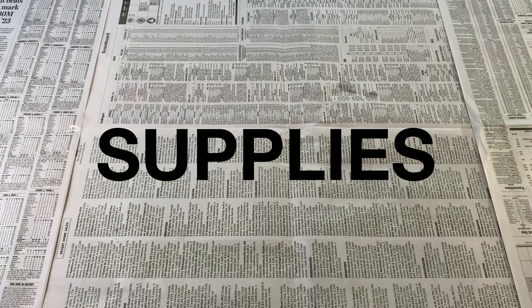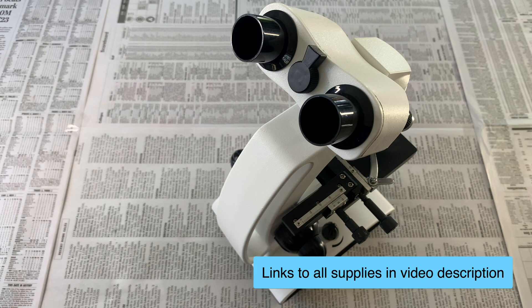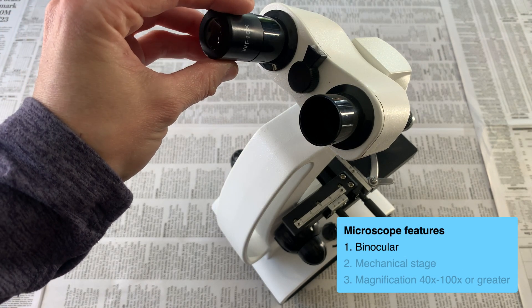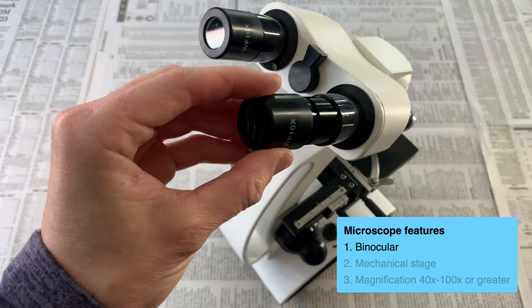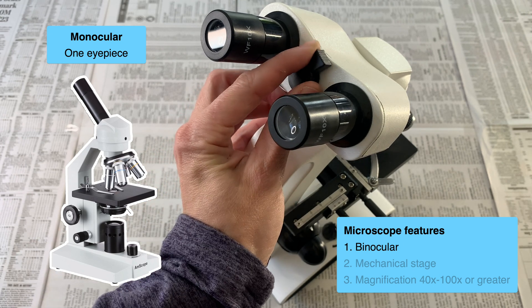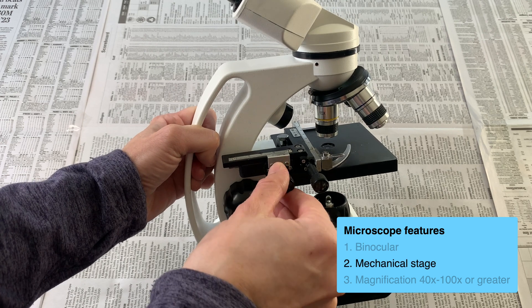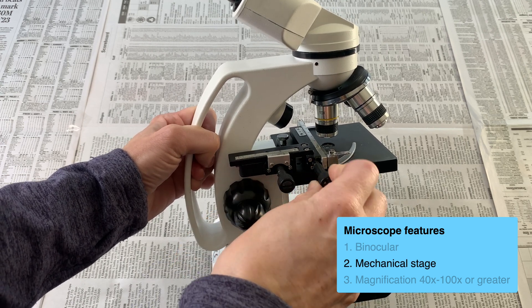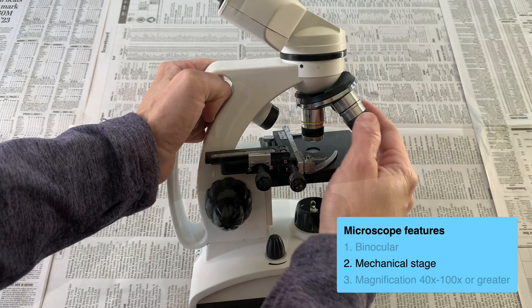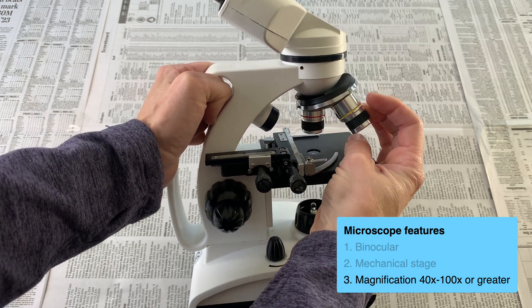Let's talk about supplies. Of course, you're going to need a microscope. I got this one on Amazon for $70. There are three features you'll want in your microscope. First, it should be binocular, meaning it has two eyepieces to look into — a monocular microscope can be used, but it can cause a lot of eye strain after even just a few minutes. Another feature you want is a mechanical stage, which has dials you use to move the slide around when viewing, making navigation more precise than moving it by hand. Finally, the microscope should have magnification ranges from 40x to 100x or greater.